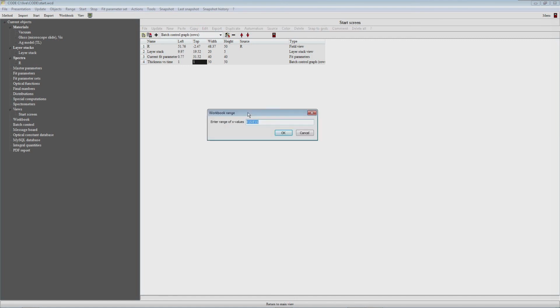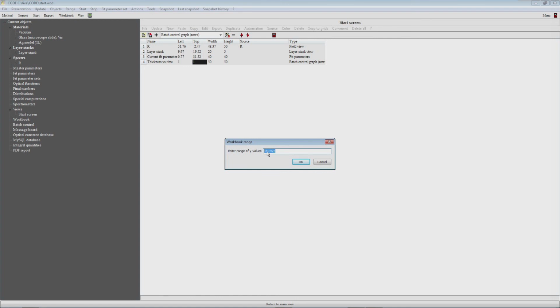and it will first ask us the range of the x values. I remember that it starts with B3. I think it ends with W3, but I'm not sure. Maybe we have to correct it. Maybe not. That should be the last x value, and then it will ask for the range of y values. First thickness was B15, and then consequently the last one should be W15.